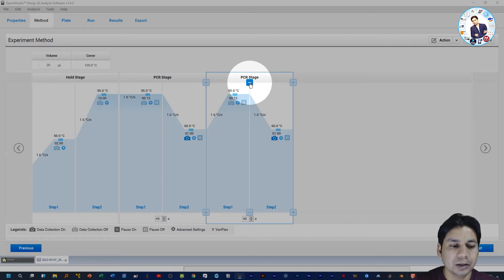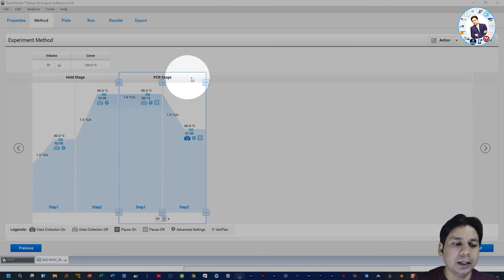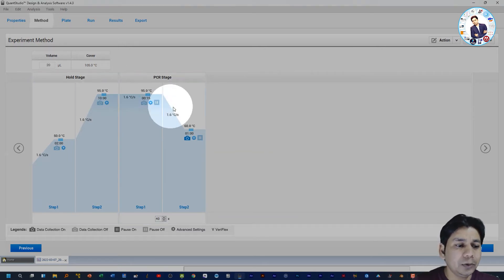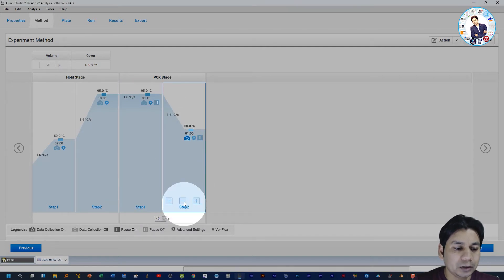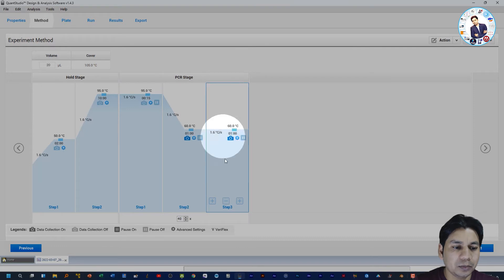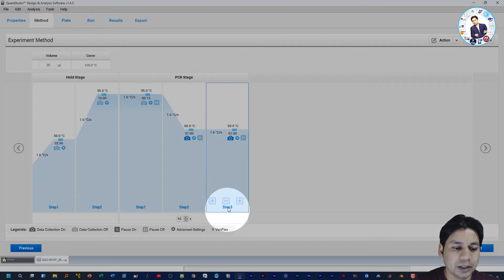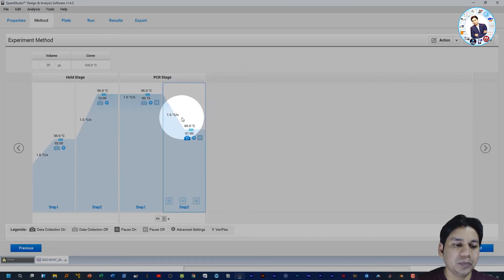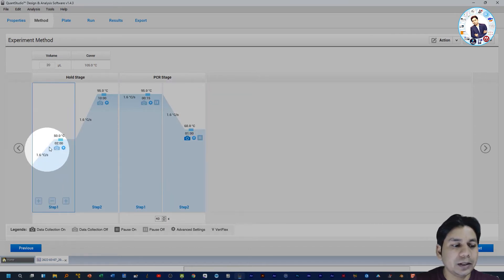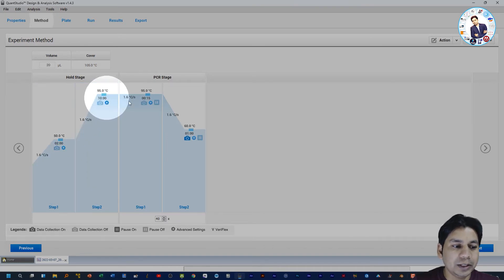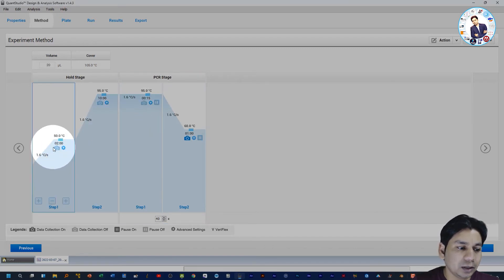To delete a stage, just click the minus button and the stage will be deleted. To add a step within the PCR stage, click the plus button and one more step is added. To delete a step, click the minus button and the step will be deleted.